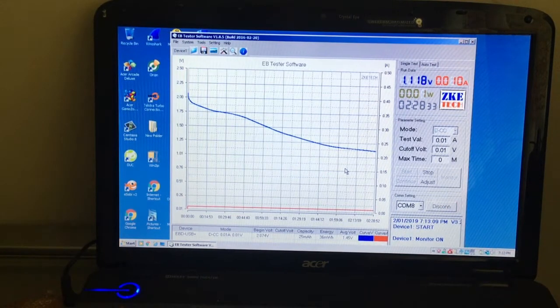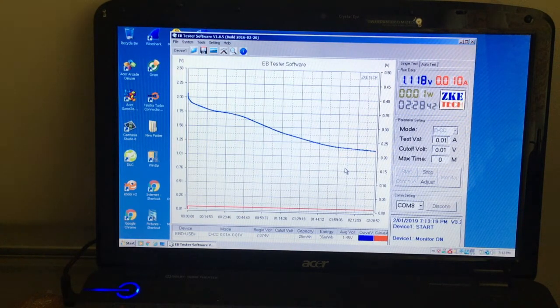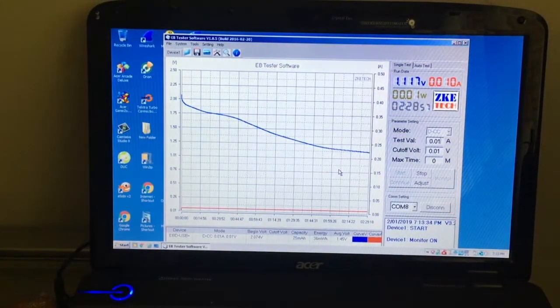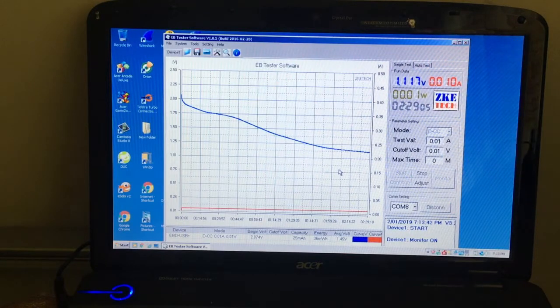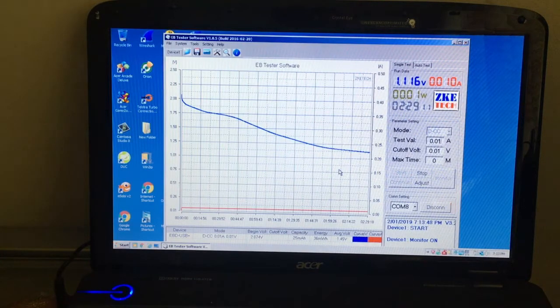The cell's now at nearly two and a half hours and 25 milliamp hours and 36 milliwatt hours. Looking alright for the first run. And the electrolyte, it's pretty clean. I think some of the zinc sulfate is dropping out. So it needs a stir tomorrow. I'm sure if it's going to run the same tomorrow. It's 1.1 volts at the moment and holding strong.